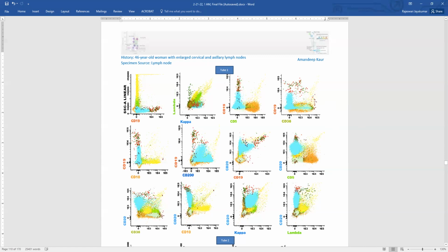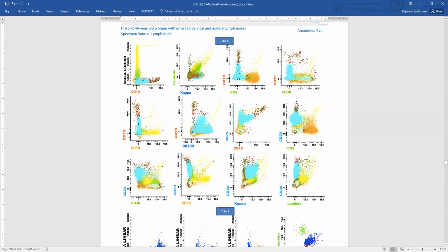Now we have to remember that plasma cells aberrantly can express CD20. So that is something to keep in mind, but we'll discuss details about that later. And again, our B cells are all negative for CD5, I mean the neoplastic cells. And in CD38, you just see a spray of cells that are positive to negative. They are again kappa restricted.